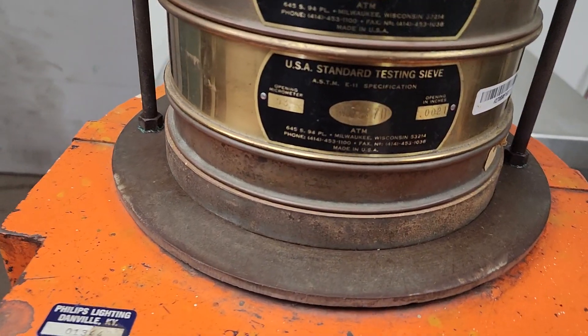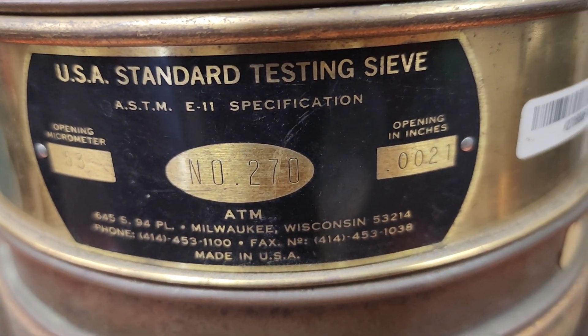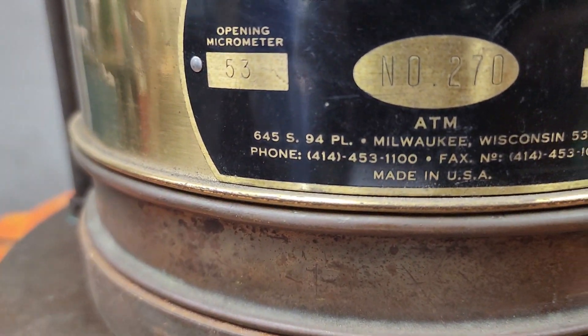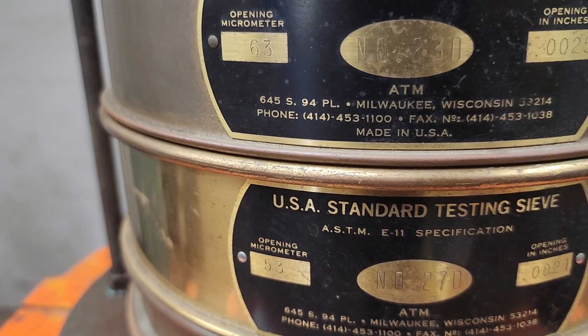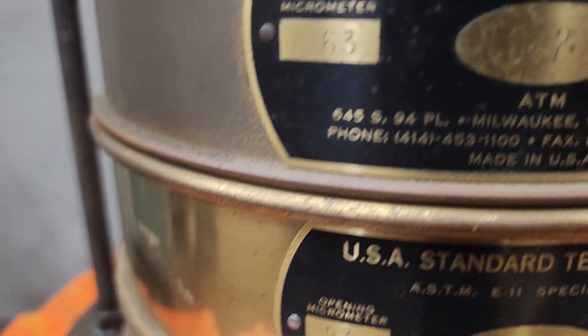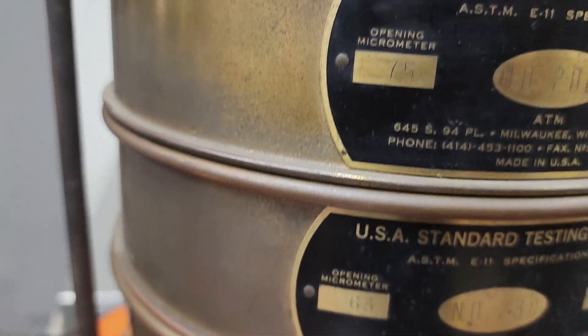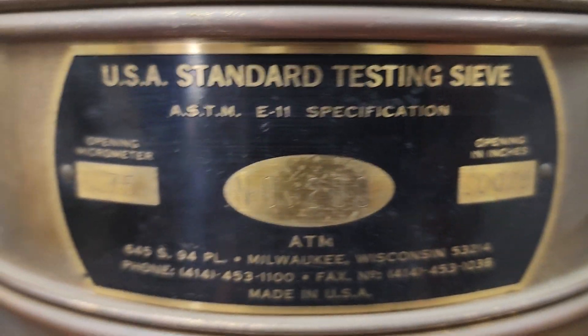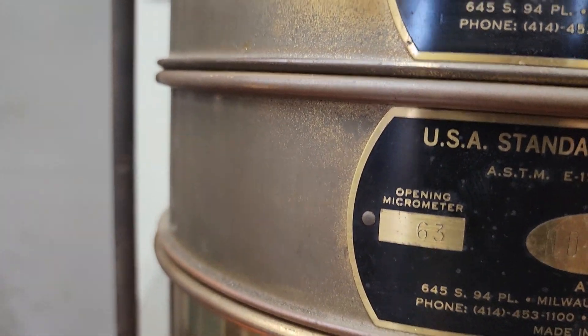It's got five sieves in it. I think I got these arranged right. The 270 is 53 microns. The 230 is 63 microns.